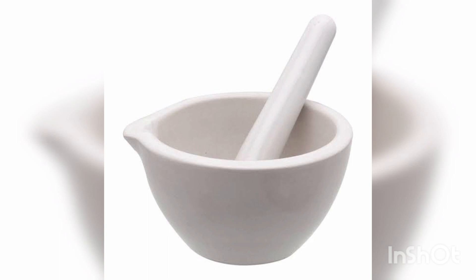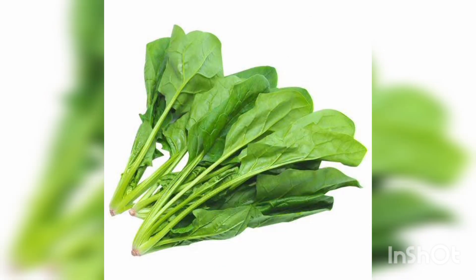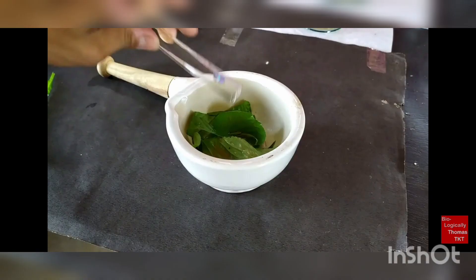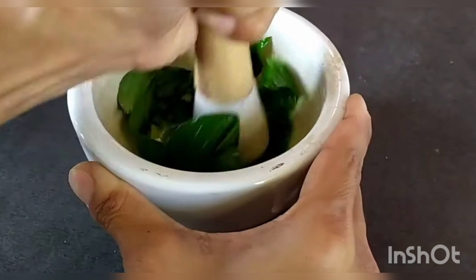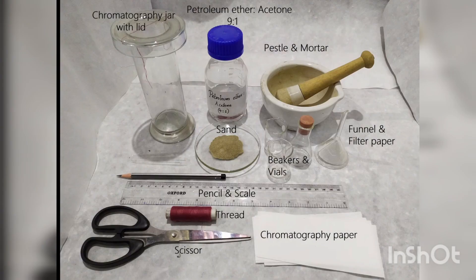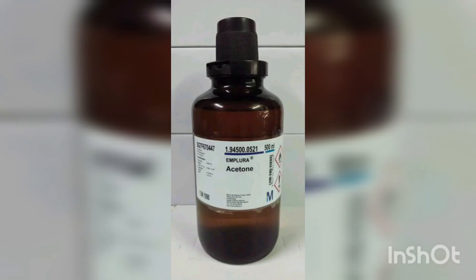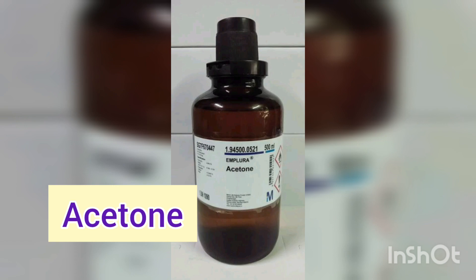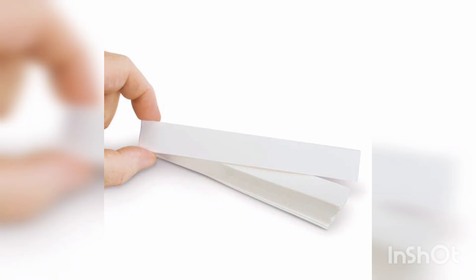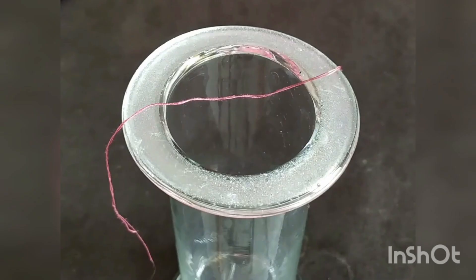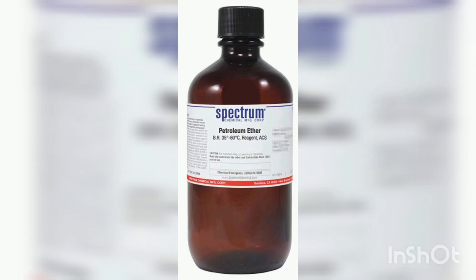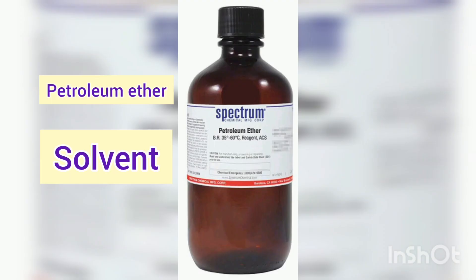We will use spinach leaves. You have to grind these spinach leaves by adding acetone, after which you will have a paste-like extract. This extract is used for identification of different pigments. Here are the requirements: acetone, paper strips or chromatography strips, a jar used to hang the strip, and petroleum ether which goes into the jar.